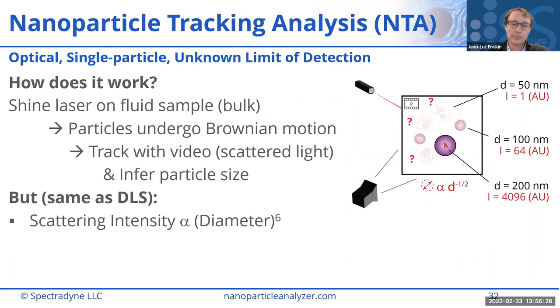Sort of. I'm also wondering for longer things like that, like if it's multiple hours, you have to change the cartridge. And what's the limitation of the cartridge? Is it drying the material out over a certain amount of time?